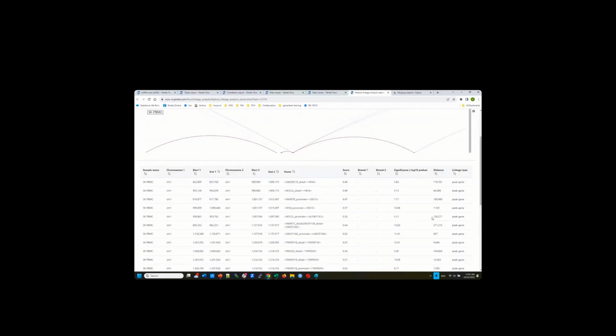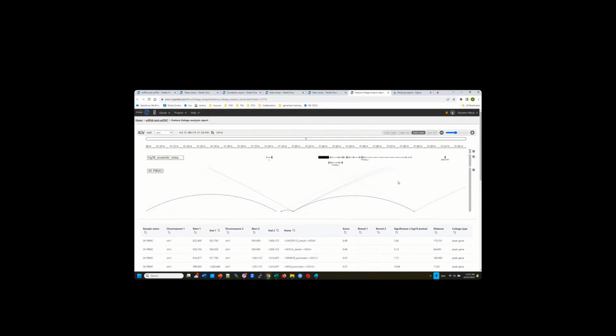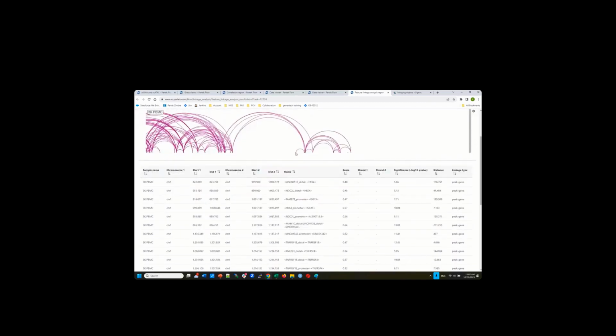this kind of integration, but currently, to be honest, they perform each sample separately. If you have multiple samples, that's going to be a limitation for this type of analysis. I think it's useful if you know a particular gene you care about, or one on your significant list, and you can focus on that particular gene to see which regions relate to the gene, or a particular region and which genes correlate with this region. That means this region will regulate the gene, right?